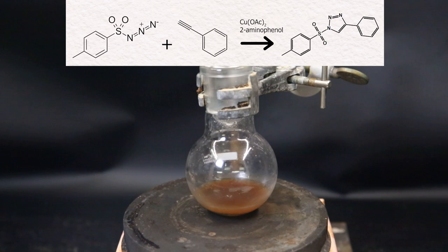In this click reaction, we are coupling tosyl azide and ethinyl benzene. The copper 2-acetate monohydrate is the catalyst and 2-aminophenol is the reducing agent. The 2-aminophenol will convert the copper 2+ to copper 1+ which will catalyze the reaction.